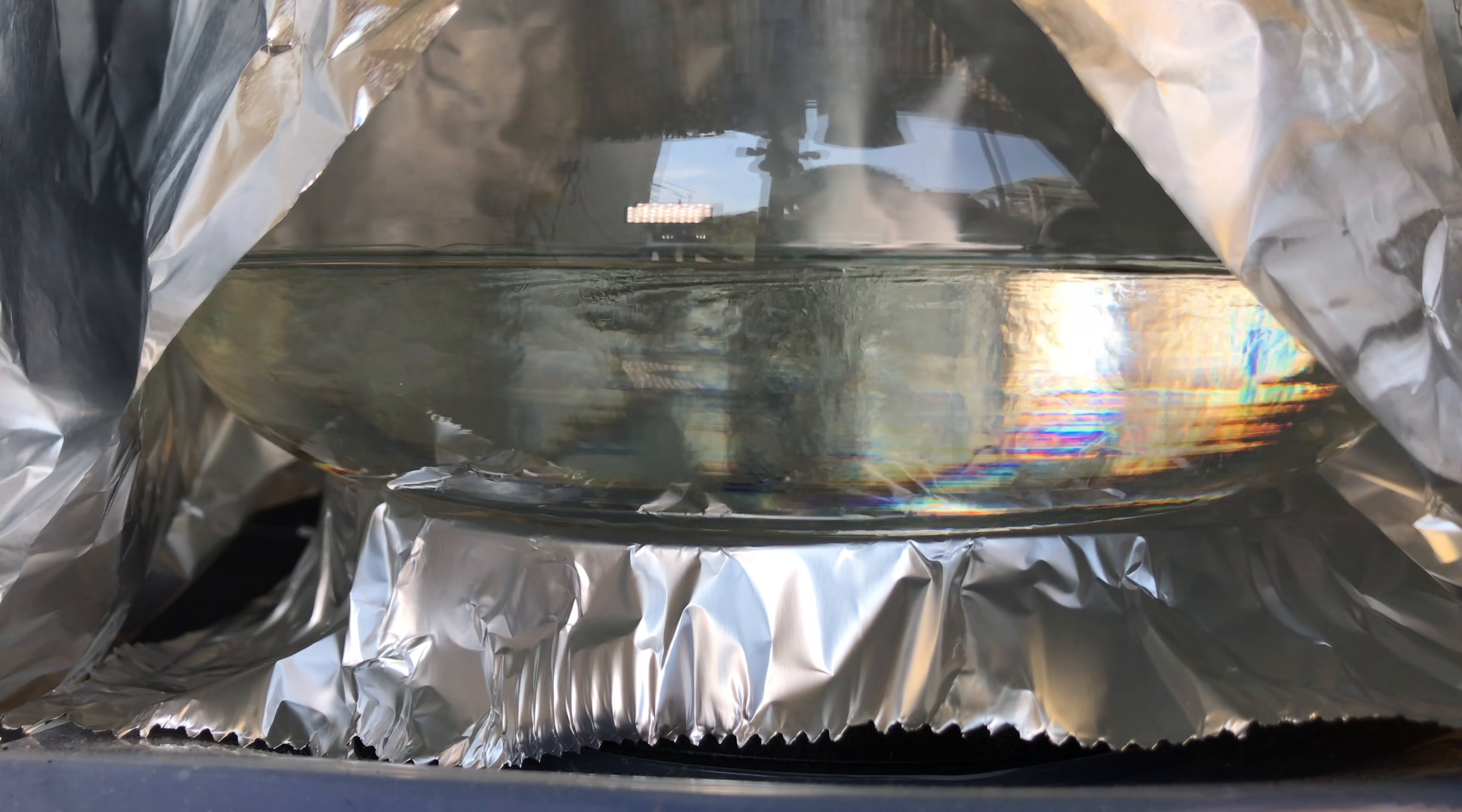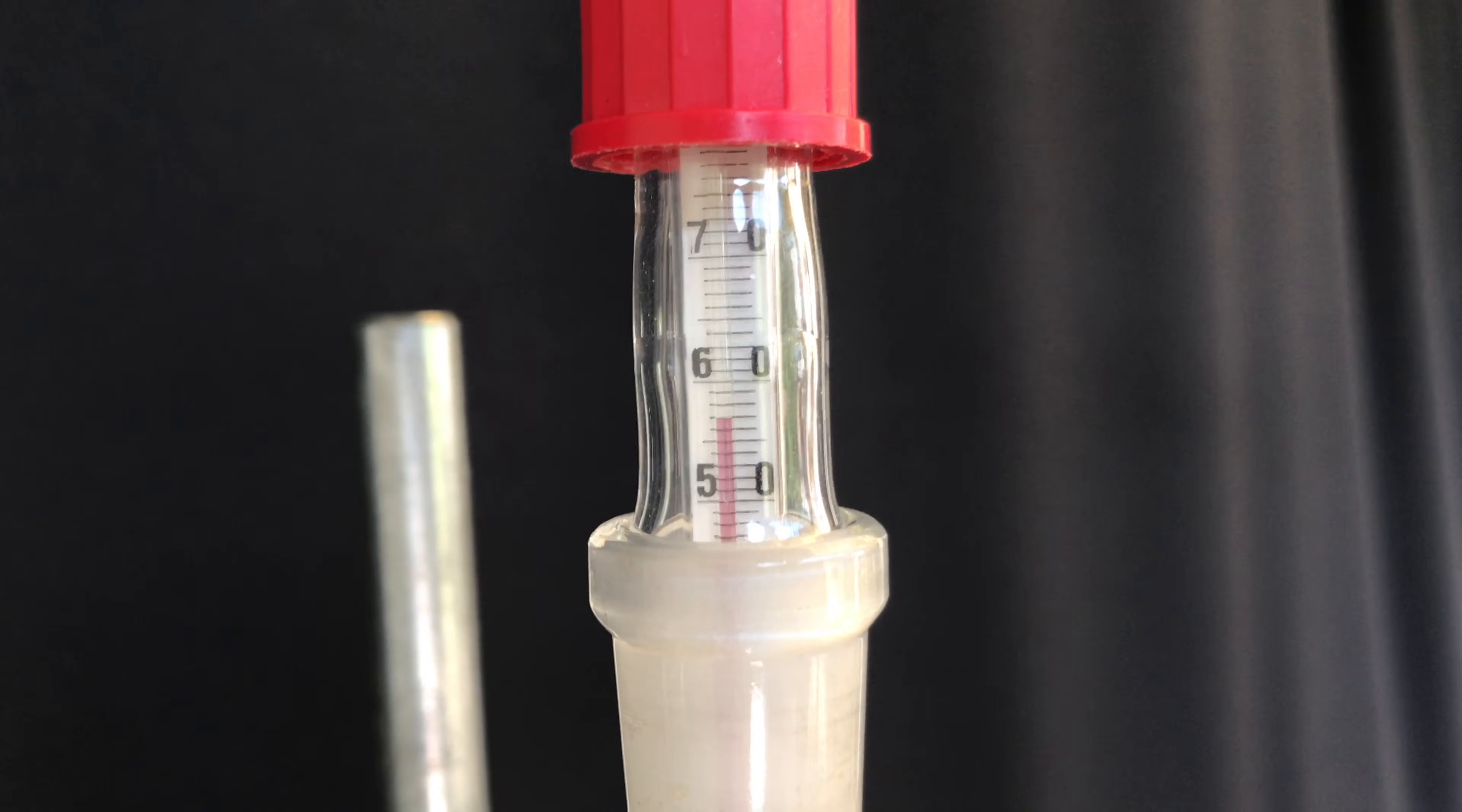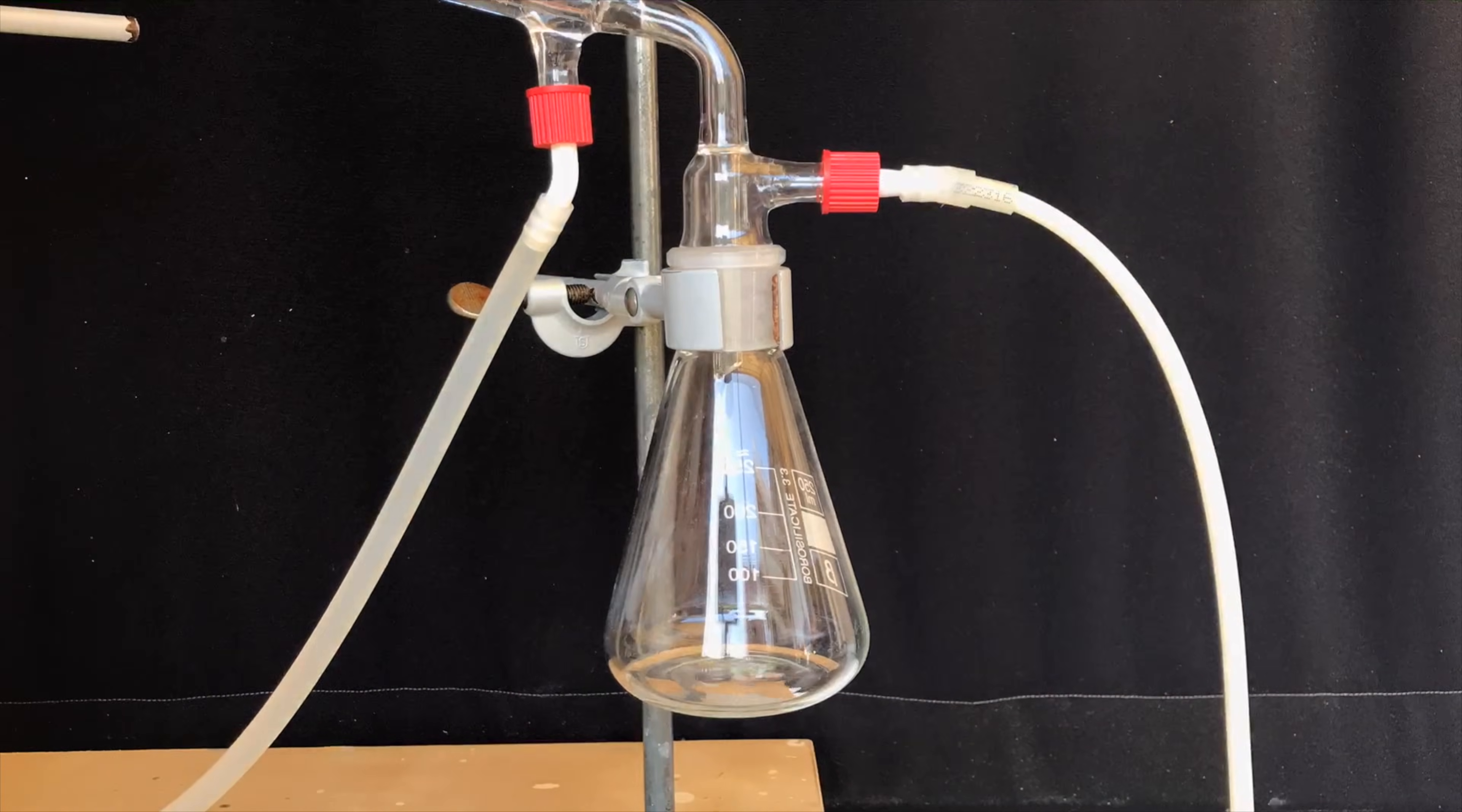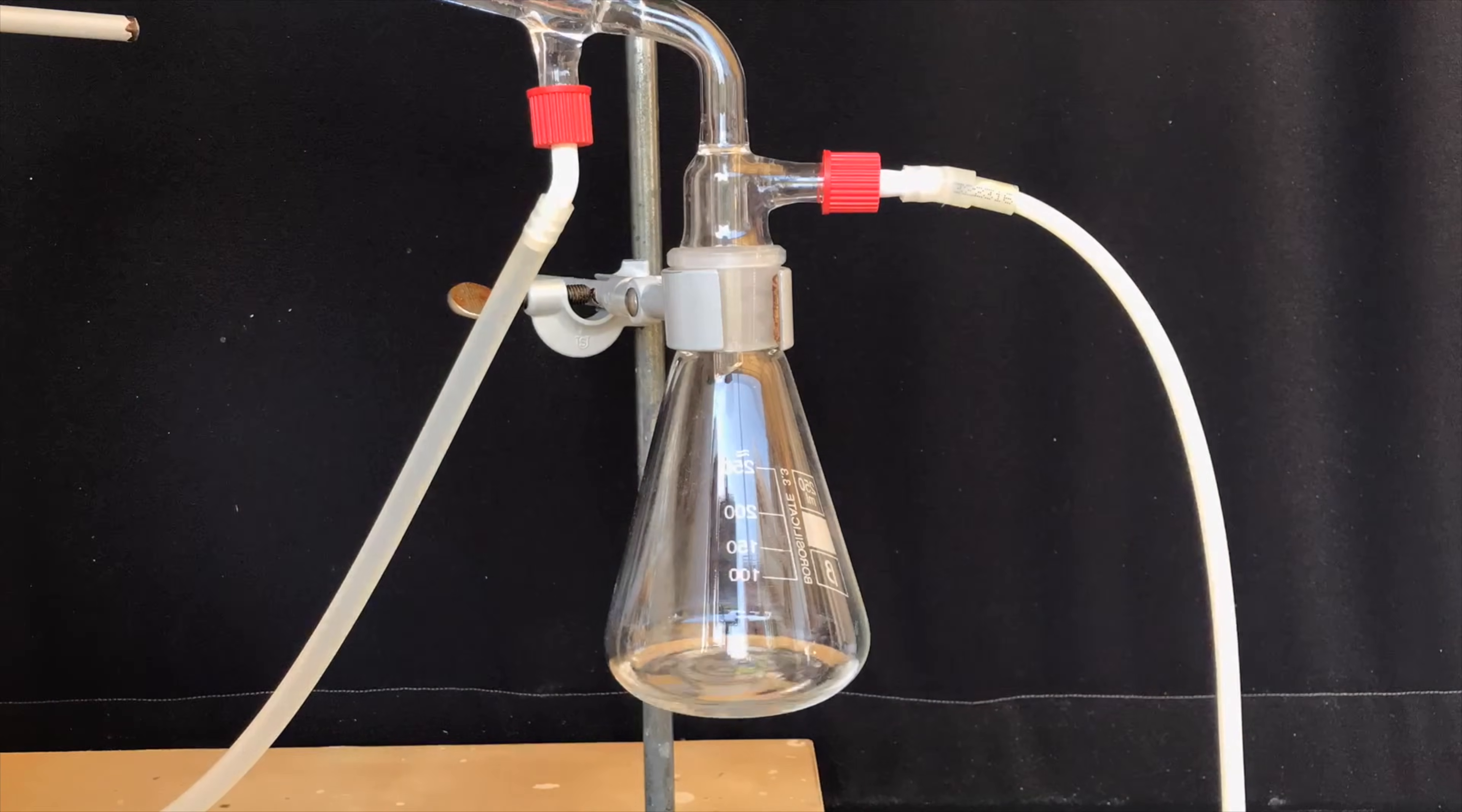In solution you have an equilibrium between acid and acid chloride and as propionyl chloride can easily be distilled off, we can remove it from the equation. The hot plate was set to a temperature of 200 degrees C and what came over had a temperature of between 60 and 85 degrees C.